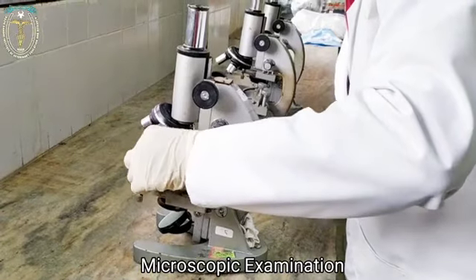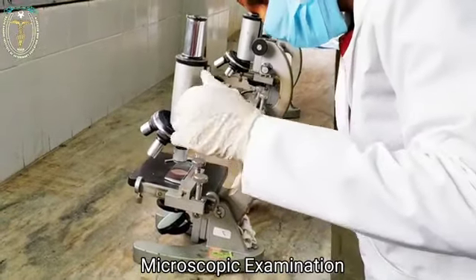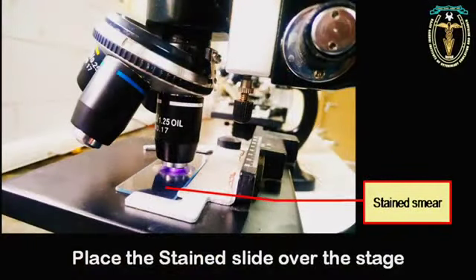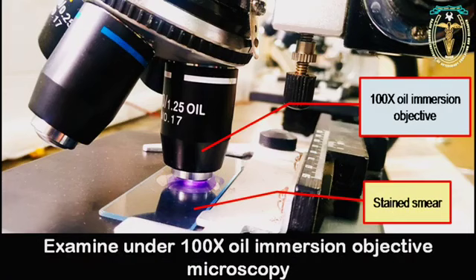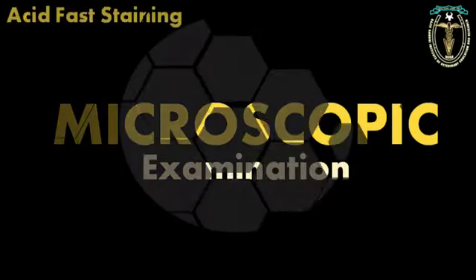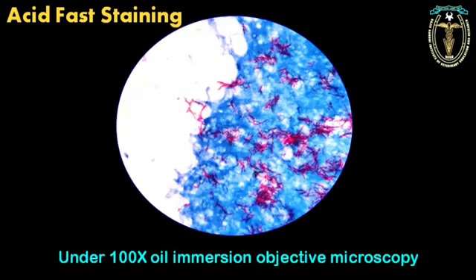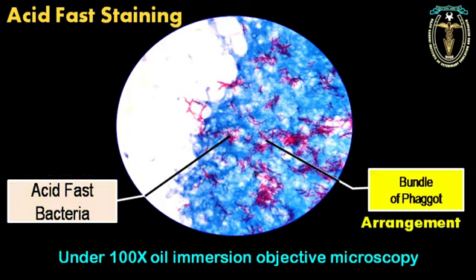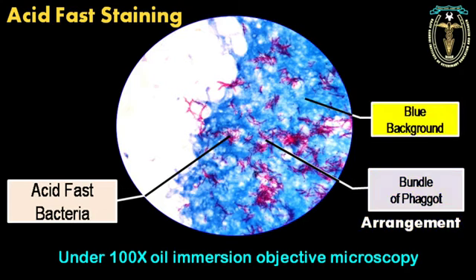The microscopic examination. Place the stained slide over the stage. Examine the slide under the 100x oil immersion objective. On microscopic examination following the acid-fast staining technique, the acid-fast bacteria stain pink, are slender rods, and are arranged in bundles, a faggot arrangement. Due to the methylene blue counterstain, the background is stained blue. This background gives a good contrast for the acid-fast bacteria in pink.